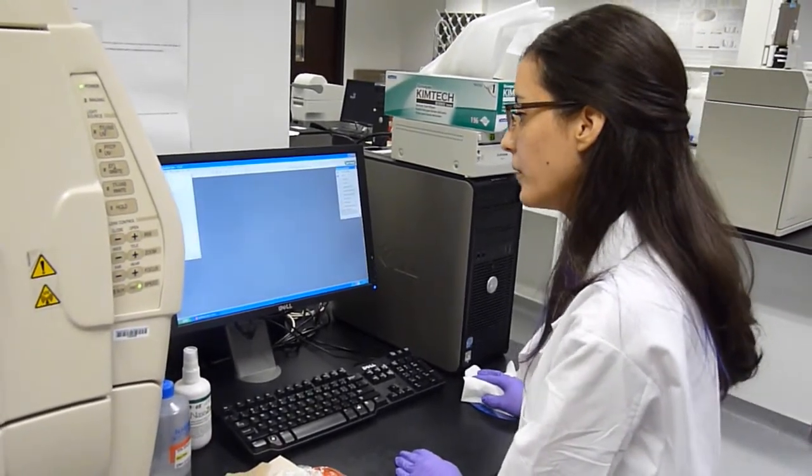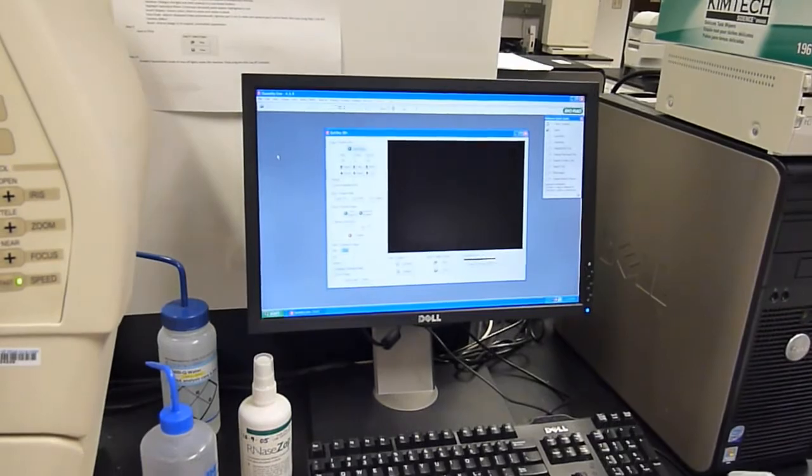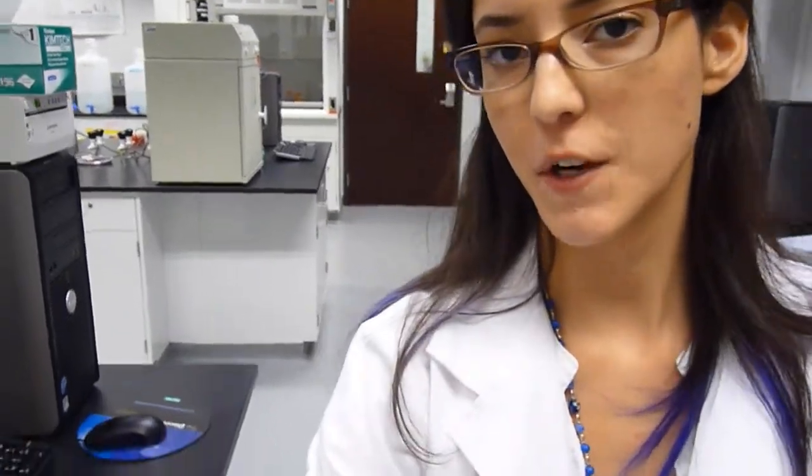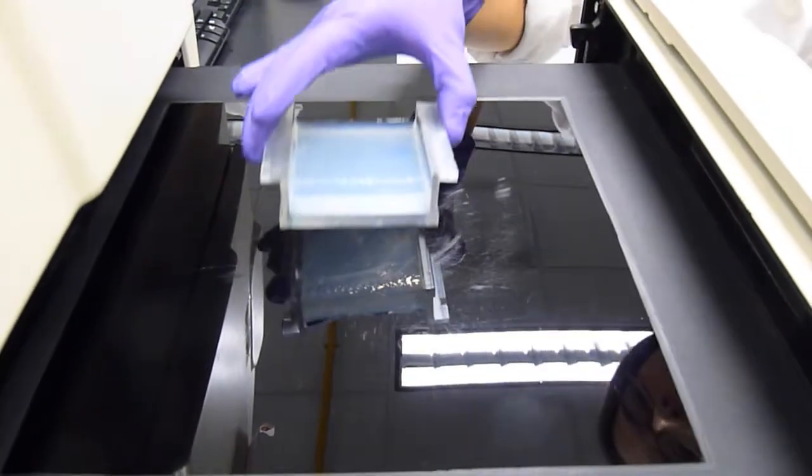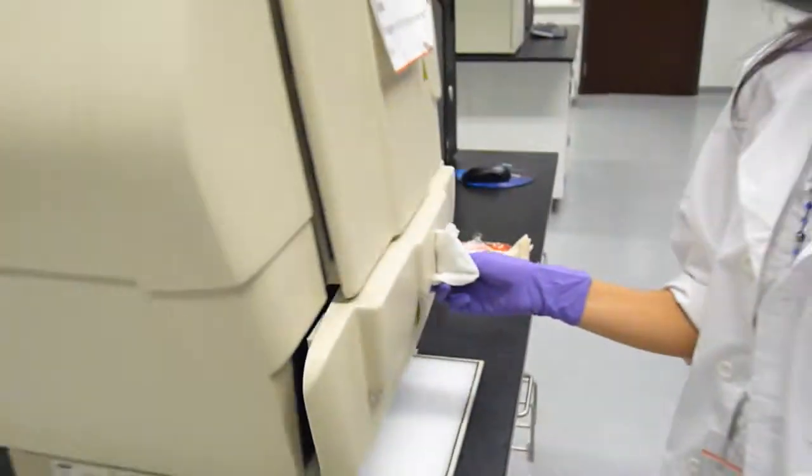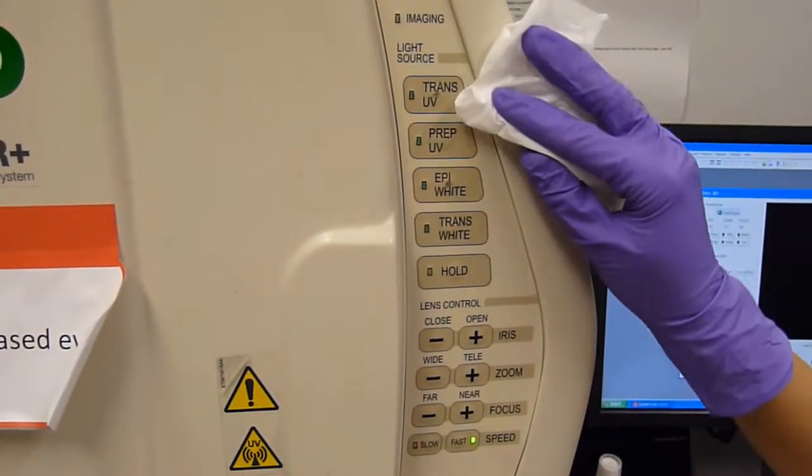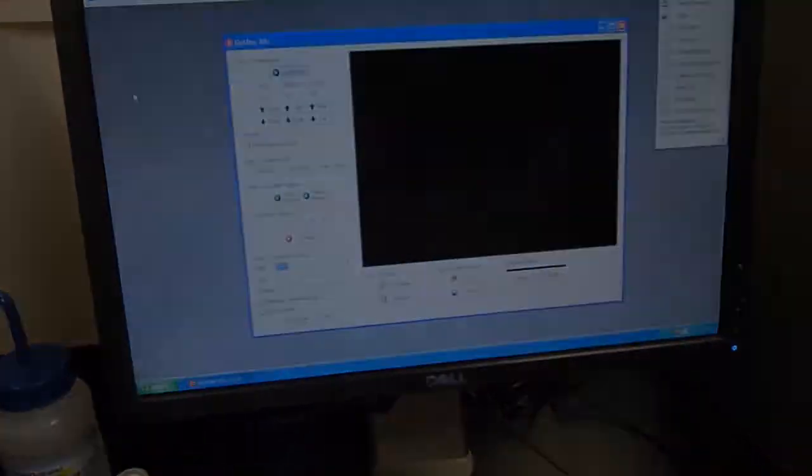Next, we're going to go to File, GelDoc XR. Open that. Once the software is ready, we need to open our tray. Load your gel. Place it in the center. And close. Because this is a fluorescent sample, you want to click on the Trans-UV button. After you have your tray inside, you can adjust the zoom focus features as you like. You can also use the acquire image and optimize display features on the software to try to get the best image possible.